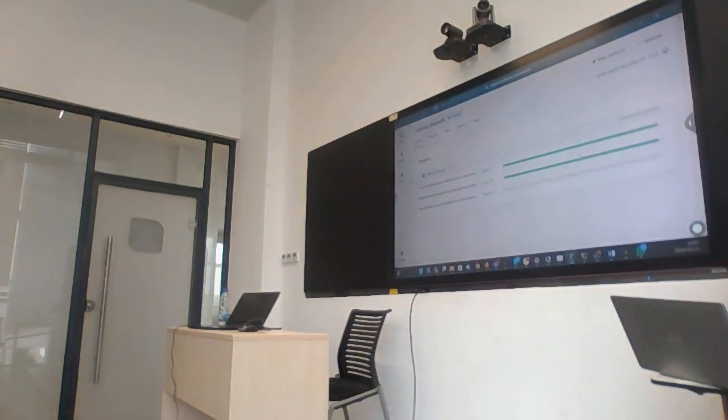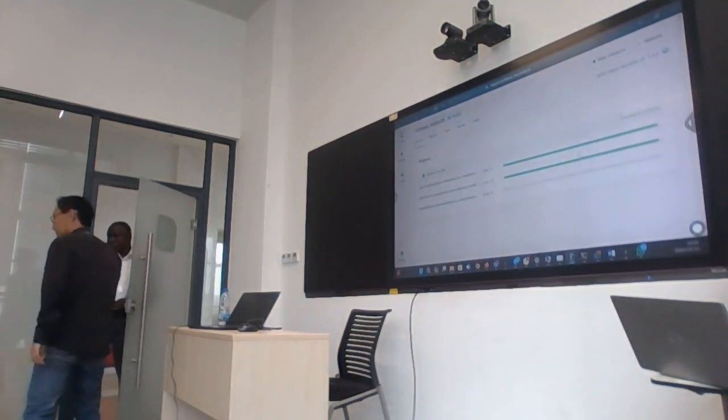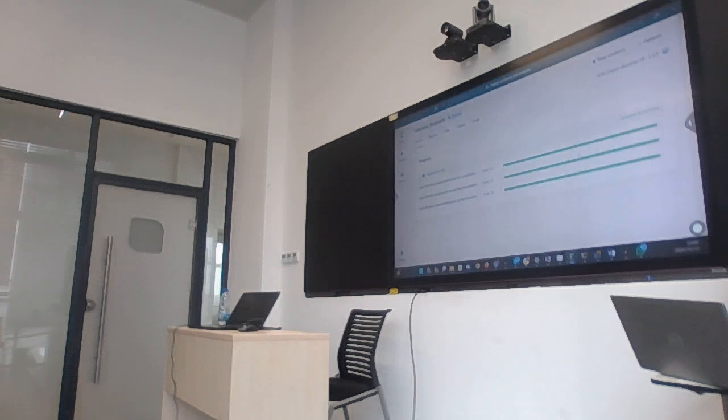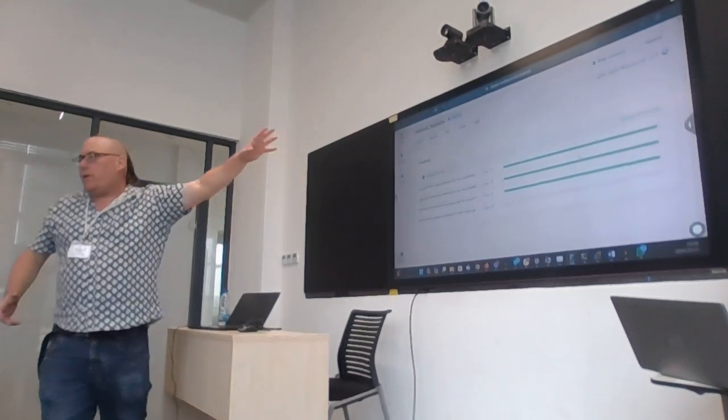No, it's faster. It's green. Fetch hostile is green. Green is really good. It's kind of hard to read the screen because the names are long.